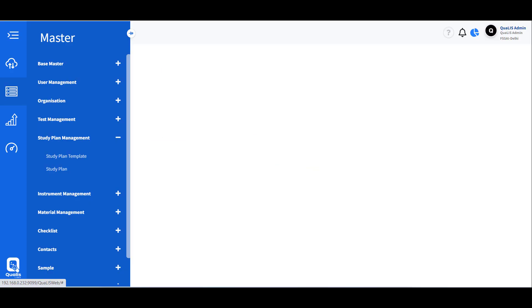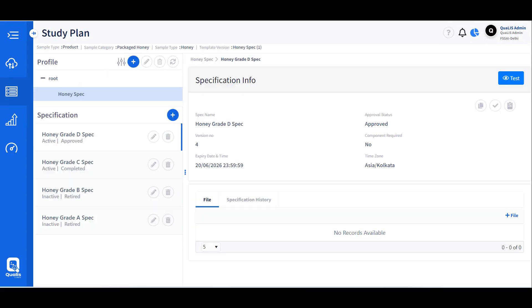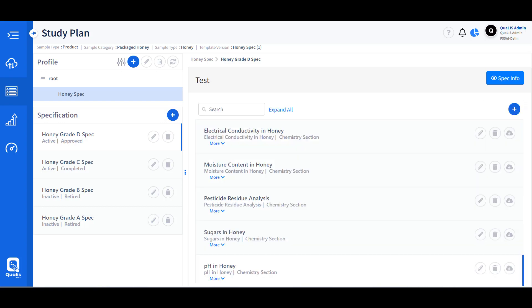Products are associated with the respective tests to be performed based on the nature of the product and the test requirements. Each product is defined with appropriate specification limits and reviewed and approved before it is used for registration of samples. The limits are then validated during result entry.